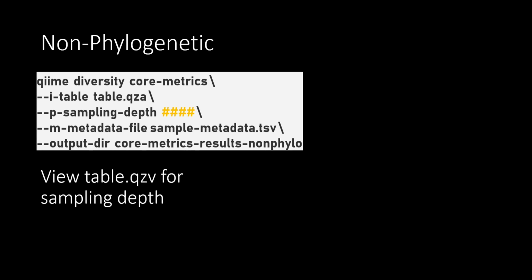And to determine what the sampling depth is, this is just a reminder, you can look at the table.qzv file to determine the sampling depth.